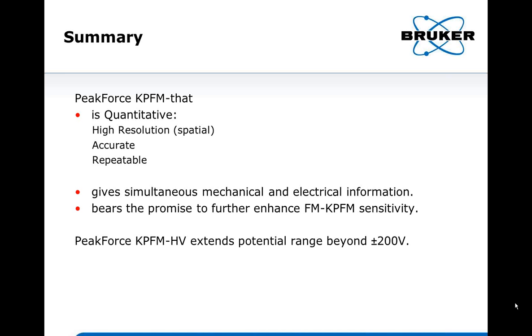Another question: absolute contact potential value change versus lift height. Once you lose contact with the surface, should it be independent of lift height? That's a very good question. In some papers they talk about the lift height. Although, by operating on the resonance and using frequency modulation, the potential dependence on lift height is not that big.